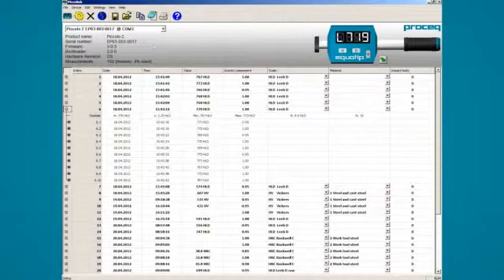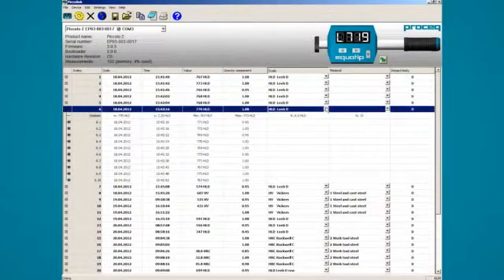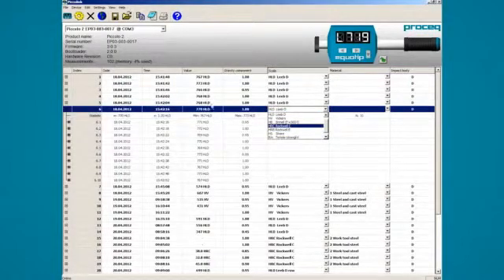Most of the functions, like save, open, and print, work the same way as with any other program. Picolink also allows you to easily convert your test results to other hardness scales. Data can be exported by using copy or export.